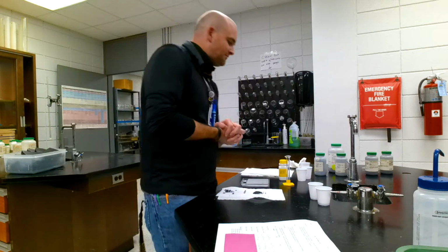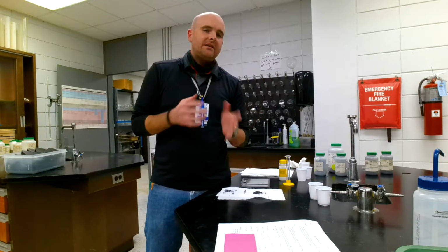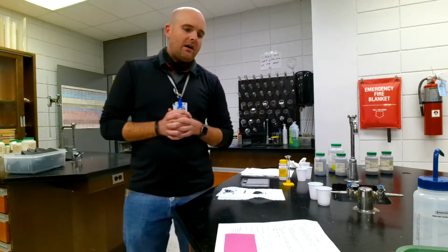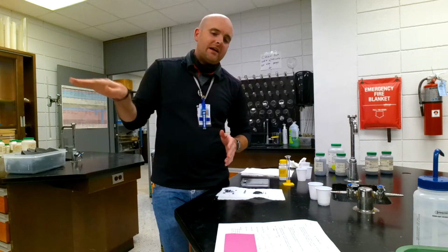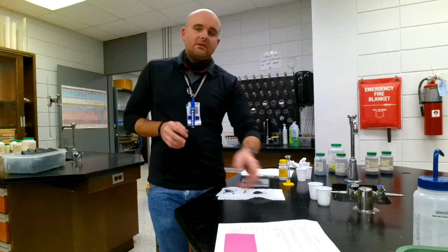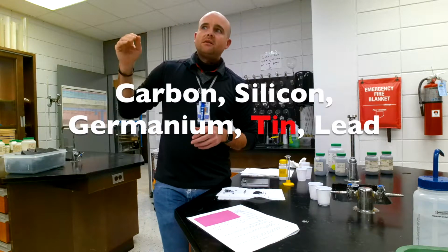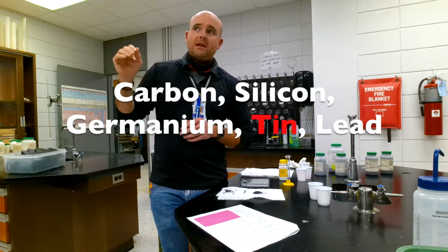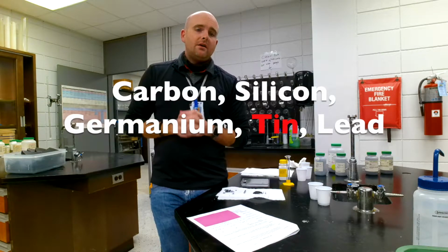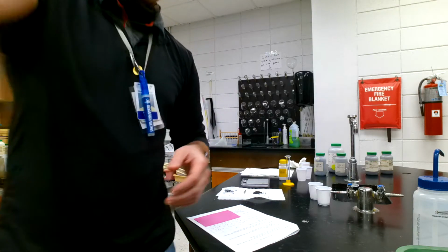Let's take a look. Our investigation here is to look at the periodicity, or the periodic trend, of density. Now, we're not looking at the actual periodic trend. We're looking at a group trend. We're looking up and down. So we're going to look at group 14, or group 4. That would be the group starting with carbon. You have carbon, silicon, germanium, tin, and lead.